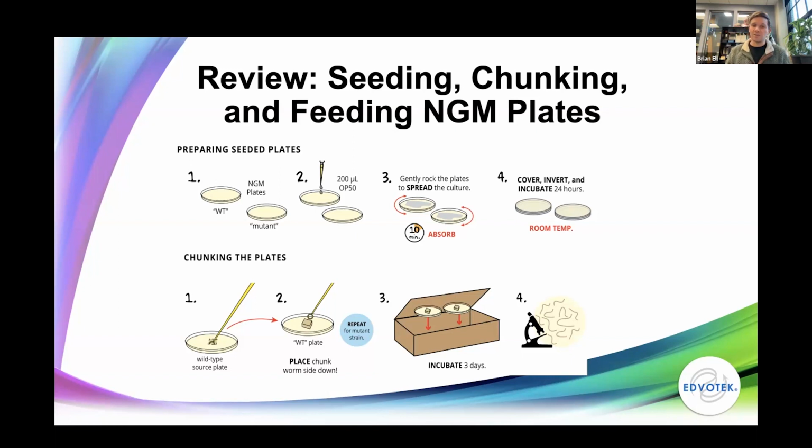So I highly encourage you to seed multiple plates at once, put them in the fridge, and then you can just pull those out as you need them, and they're ready to go for you.